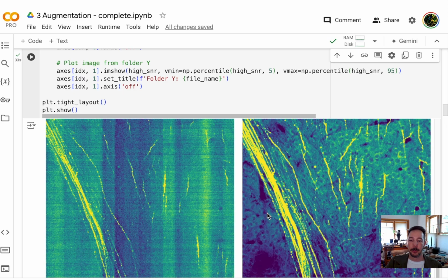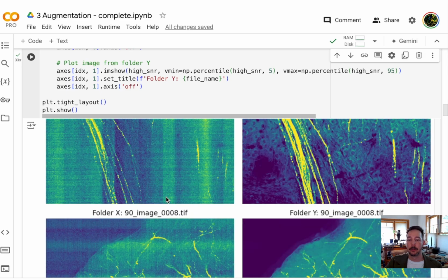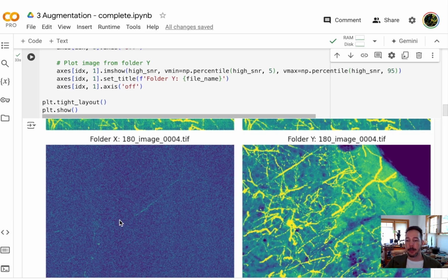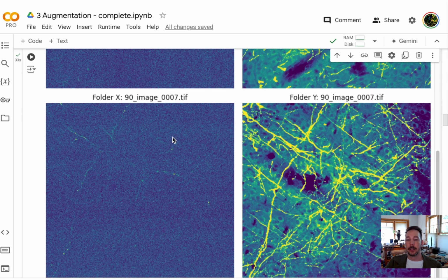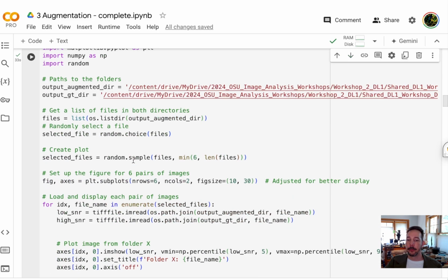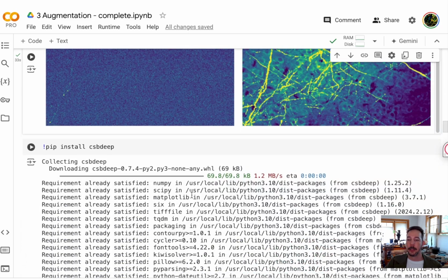I have others where we're just looking at kind of projections and more sort of tissue background. And so it's good to take patches from different areas, and some have very low signal, some have a little bit higher signal. So yeah, I think that the diversity is important in getting a model that works well in a variety of conditions.